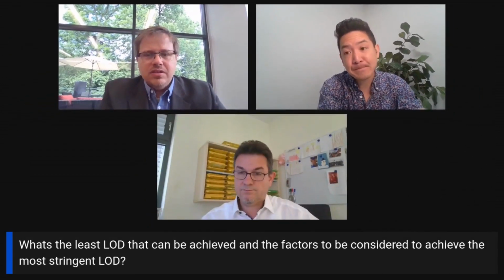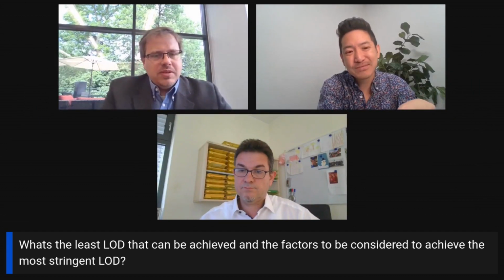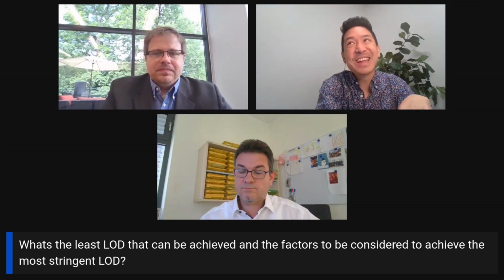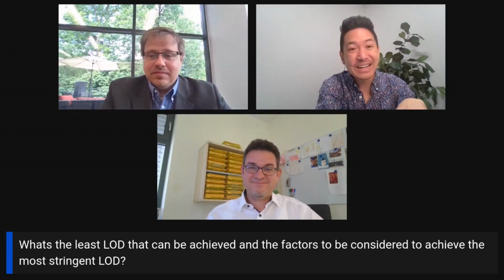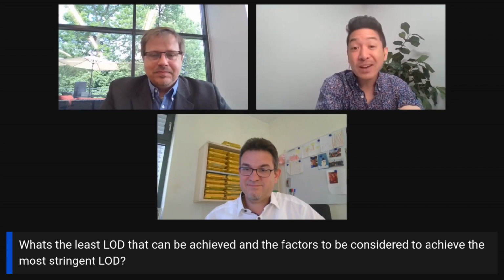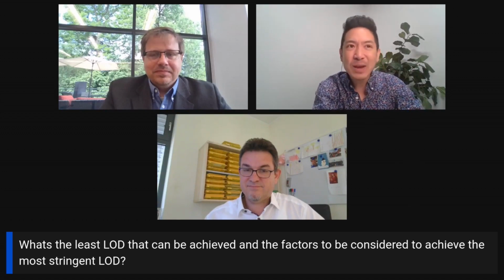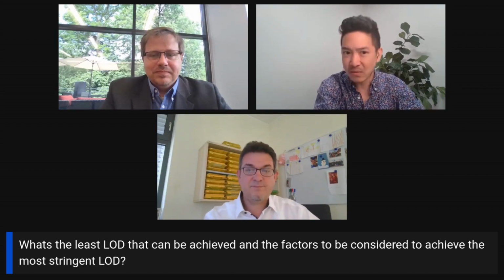All right. Thank you for that one. And then another XRD question. What's the least LOD that can be achieved and the factors to be considered to achieve the most stringent limits of detection? So the answer to every good scientific question, of course, is: it depends. We have gone down as low as 1/4 weight percent. That did require us to have an immaculately prepared sample and one that diffracted quite strongly, so a nice sharp peak. With the indomethacin example, 1/2 weight percent, I think, is detectable if you know what you're looking for.